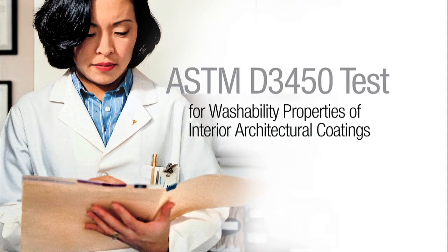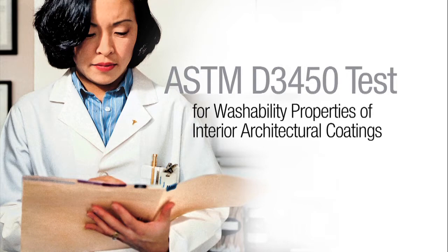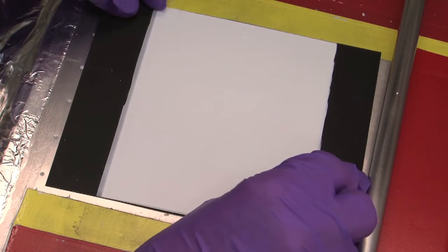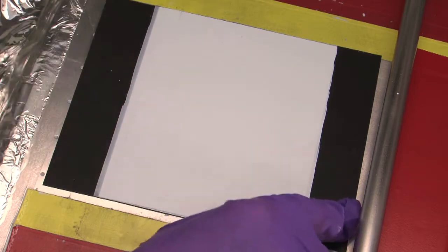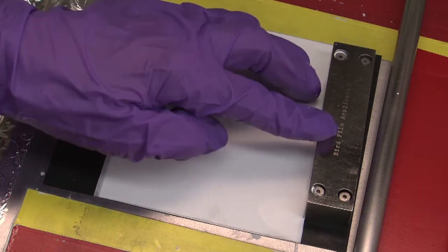To evaluate washability, we look at how easily soil can be removed from a painted surface and assess any changes in appearance. We've previously prepared a drawdown, let it dry for 7 days, and measured the reflectance.